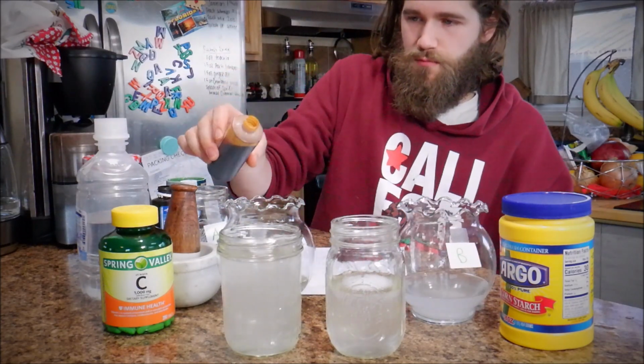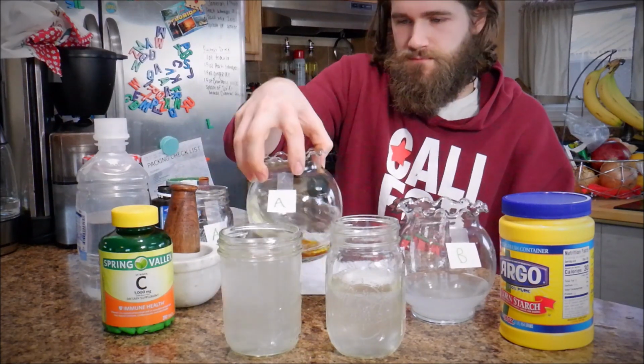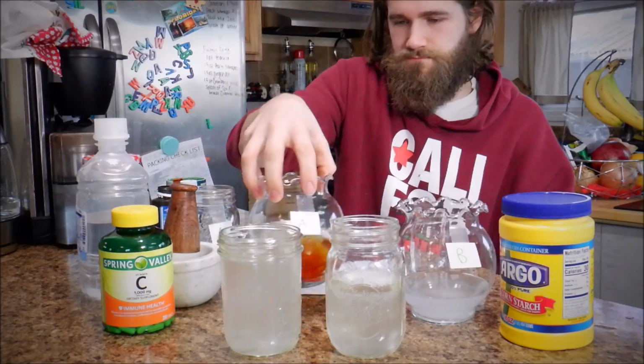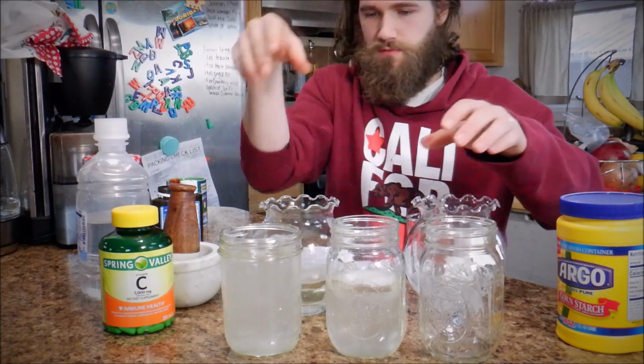Let's see if it needed a lot more of the povidone iodine than I had thought. Try number 3 here.